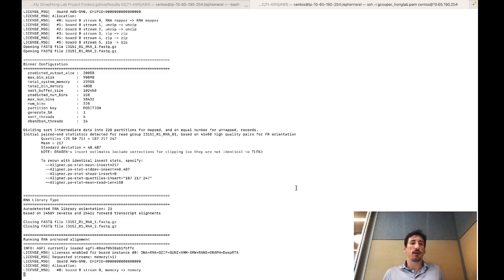So maybe this is taking a little bit longer than I thought. So I think I've timed this out. It's typically around 3 to 5 minutes per sample. So we might be getting there soon.